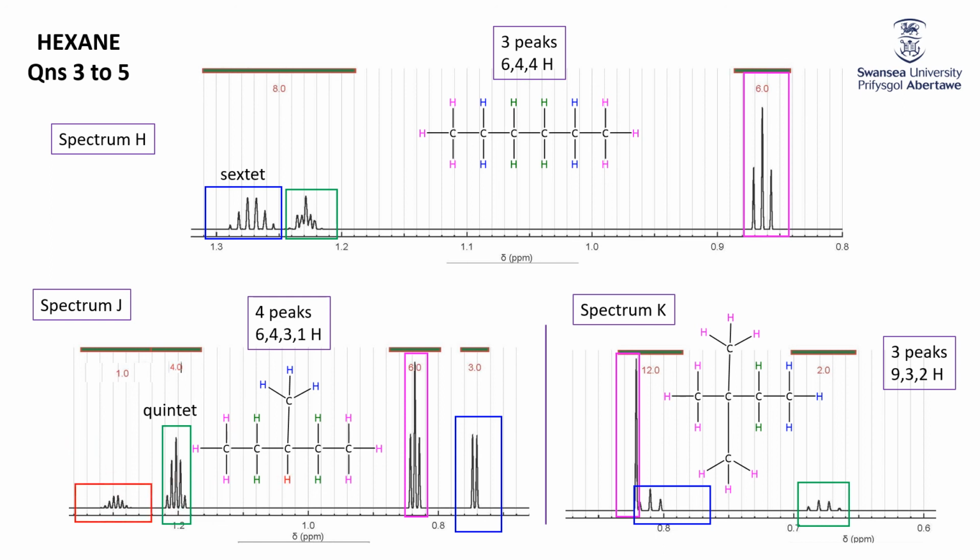And finally, this one down here must be the red one. You can see, if you've got great imagination, 1, 2, 3, 4, 5, 6, 7, 8 there. Significant imagination to see those 2 little blips down the bottom there. Well, 8 means that there must be 7 adjacent hydrogens. If we look at this red one here, 1, 2, 3, 4, 5, 6, 7 adjacent hydrogens.